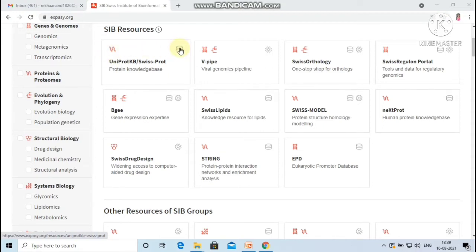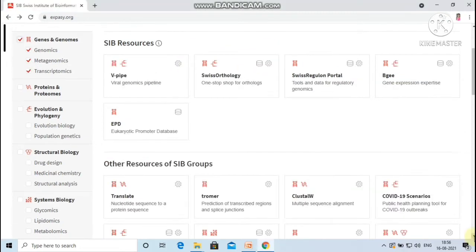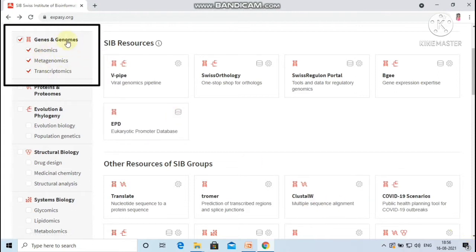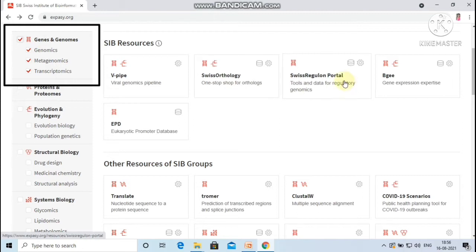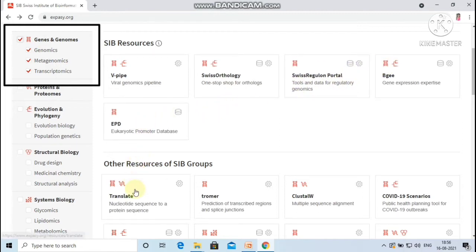This symbol indicates the resource is a database and this symbol indicates the resource is a software tool. Under the category genes and genomes there are resources like B-PIPE, Swiss Orthology, Swiss Regulon Portal, Eukaryotic Promoter Database, Translate, ClustalW, etc.